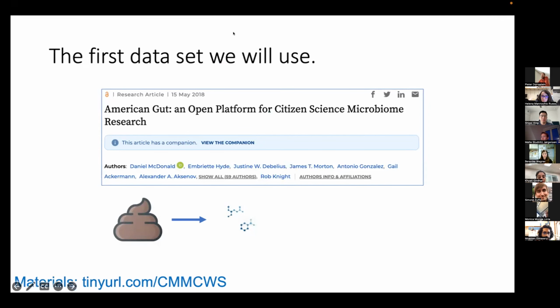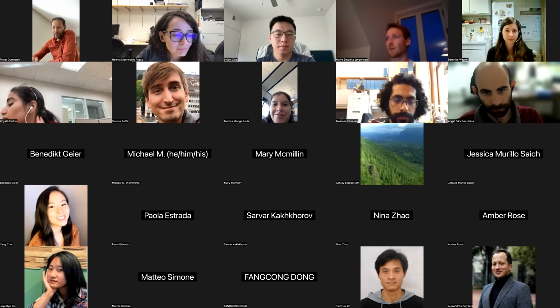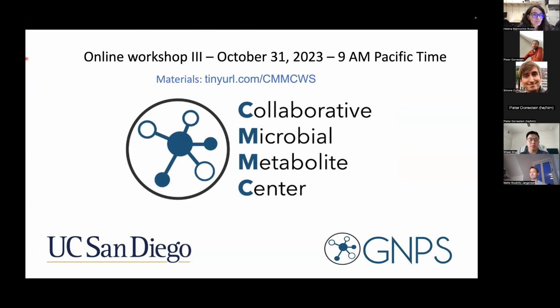All righty, are there any questions from the audience at this point? If not, then Helena will begin the tutorial. So this is one part where you can follow hands-on, so you can understand and navigate the workflow. And feel free to ask any questions at any time.